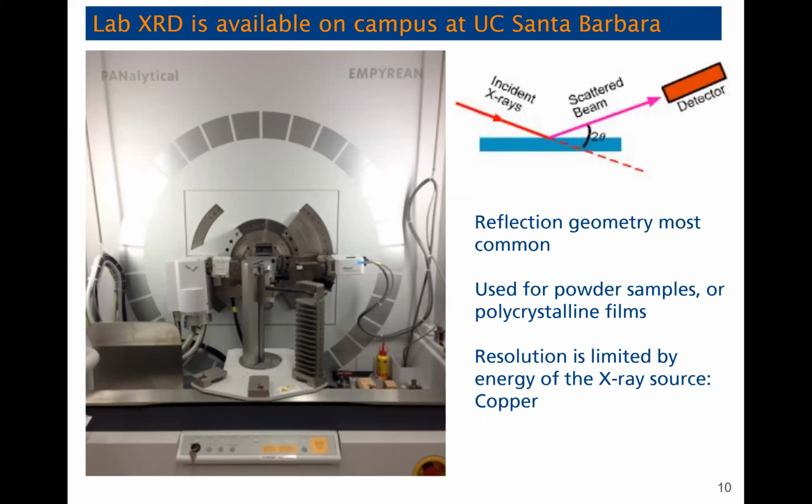But yeah, like I said at the beginning of the talk, lab X-ray diffraction is something that material scientists, especially people who work on inorganic materials like me and Elias, use all the time, especially if we're doing any synthesis and want to figure out what we've actually made. So this is a picture of the PANalytical Empyrean, which is the diffractometer that we use, sitting in Ealing's Hall.